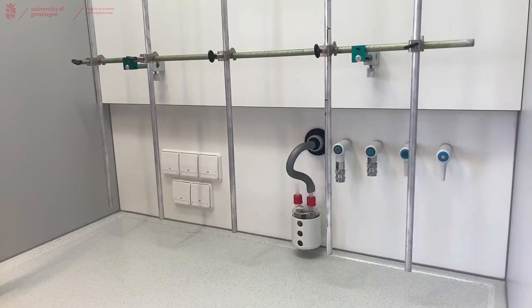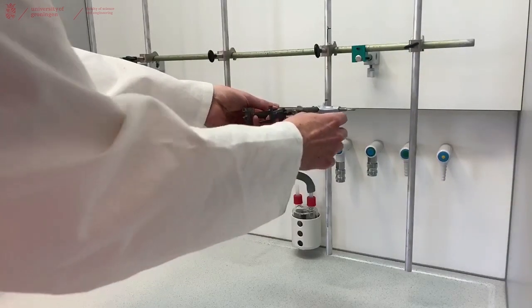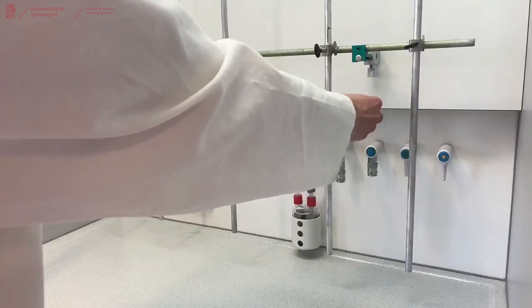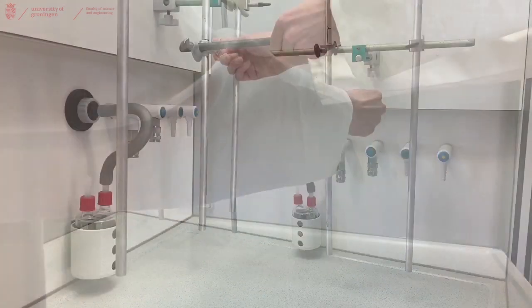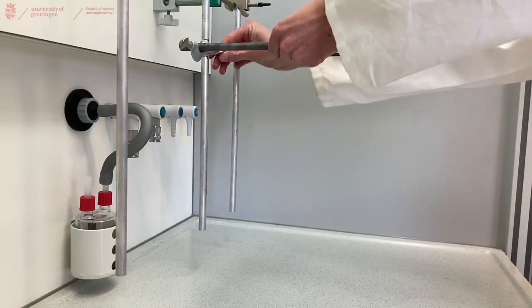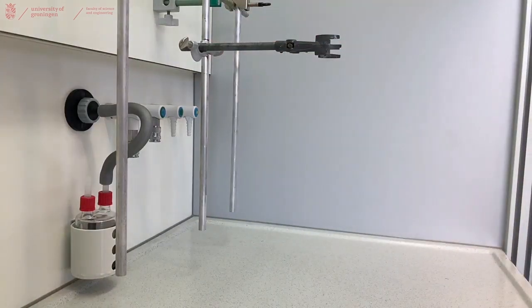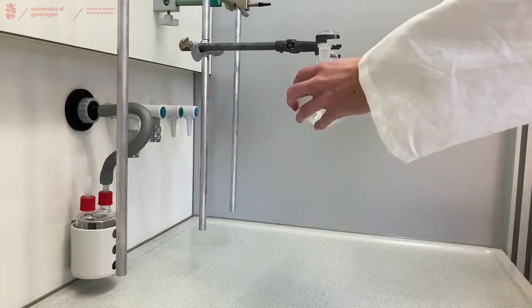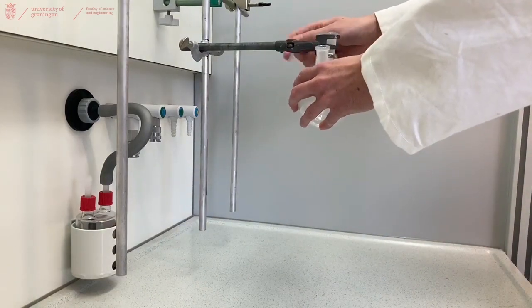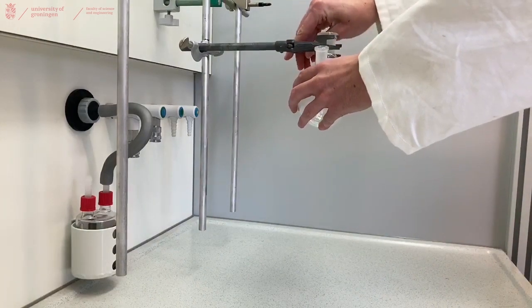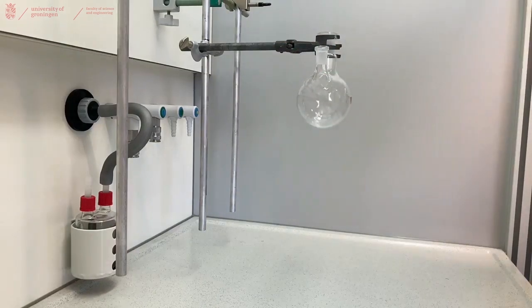To build our setup we will start with clamping our three neck flask to the fume hood. Place the clamp tight in the fume hood and attach your three neck flask. This clamping is the most important of the setup as this will be the only supporting clamp.